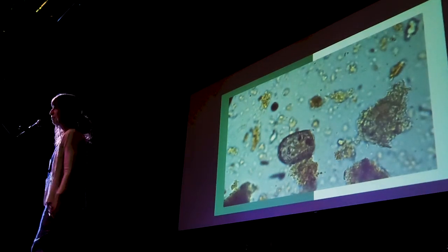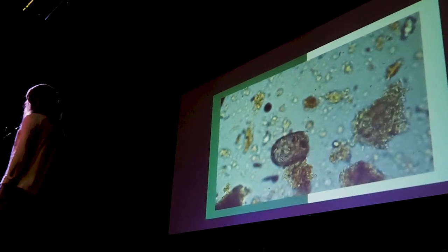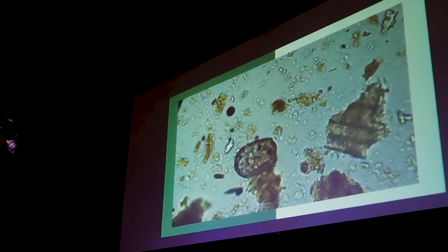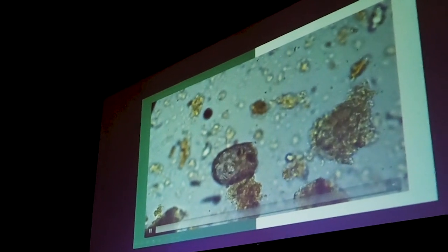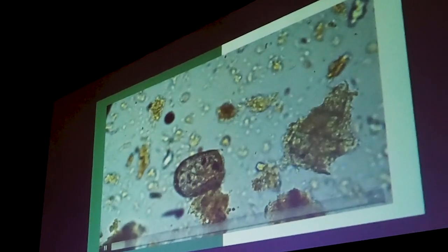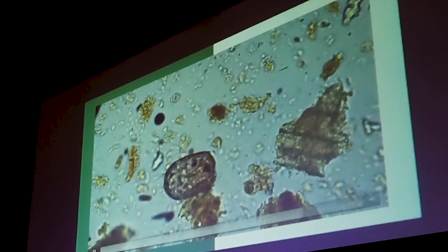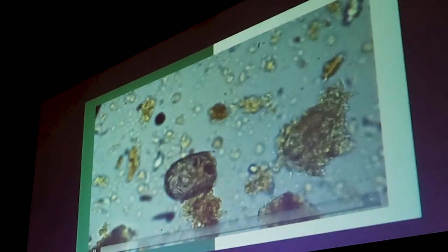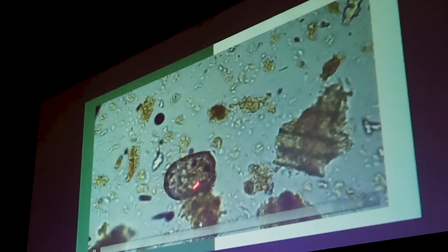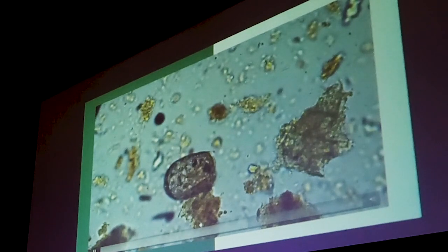Okay, now we're getting into my favorite part, show and tell. This is a purple testate amoeba. This purple testate amoeba started showing up in my compost 2 years ago. Really, really excited to find it. I didn't know they came in those colors. But what's really cool about this is I was taught at the Soil Food Web School that amoeba only eat bacteria. And so when I found these fungal spores inside my testate amoeba, I found that to be peculiar.